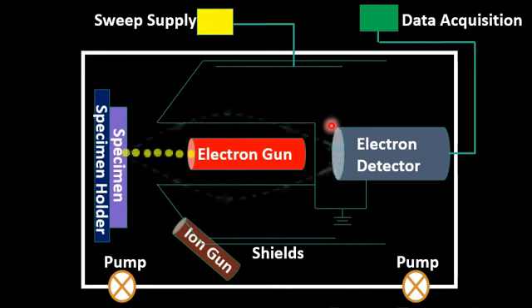On the basis of that, you can have an Auger electron profile, and from this you can have an idea of composition as well as elemental analysis of the material present in a sample. So this is just an overview of the Auger electron spectroscope.